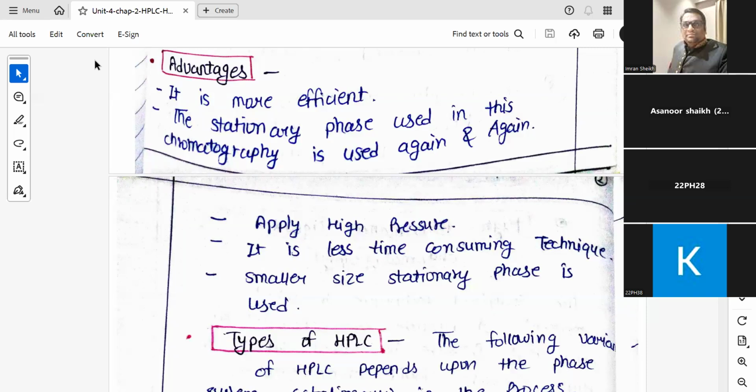Okay, if you are not performing the purging process, that means you are not interested in getting accurate, precise results. You are not a strong believer in the robustness of the results, and you have not complied with the International Council for Harmonisation processes.